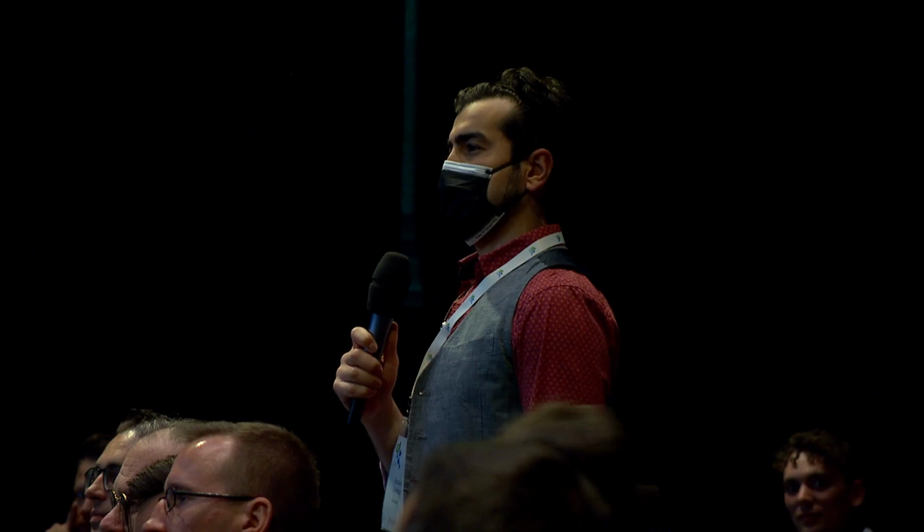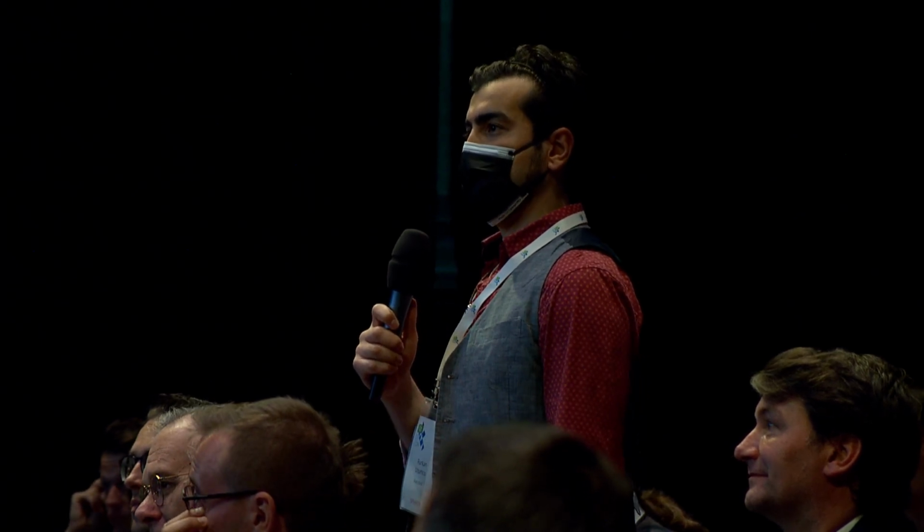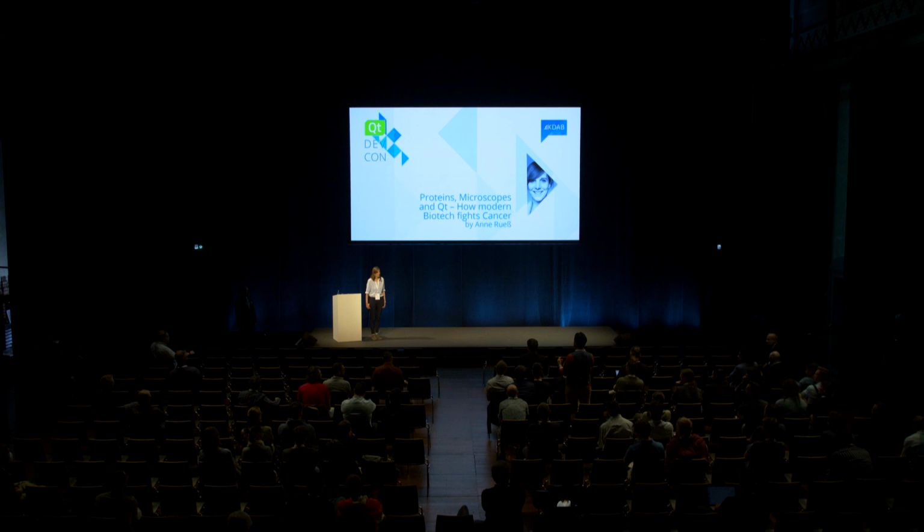And once it gets out, I'm assuming, maybe the assumption is wrong, how do you deal with possible bugs that may come out, or do they ever come out? Or if they do, what's the procedure for dealing with those things? Because it's already out, it's being used on patients. Do you see if it affected the patient in some ill-mannered way, or how does that happen? How we deal with bugs, that was the question.